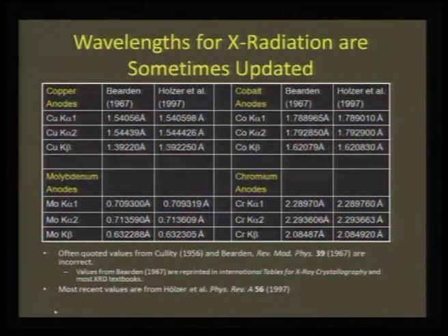And before we go more into the details or the basics of X-ray diffraction, I want to tell that in today's diffractometers, different targets or X-ray sources can be used. More popular is the copper anode, and then we have cobalt anode, chromium anode and molybdenum anodes, and each of these has a particular K alpha which is to be used in our calculations.